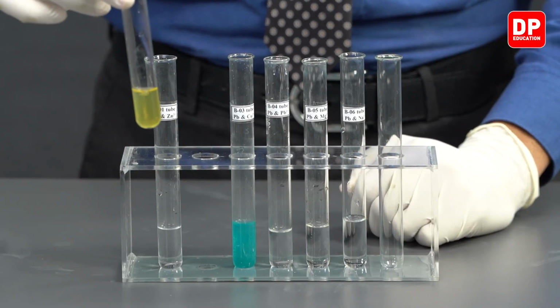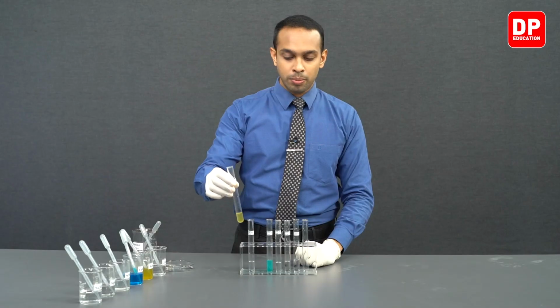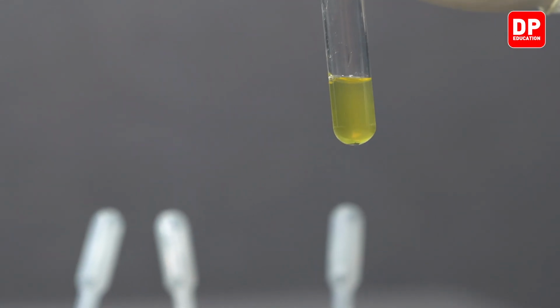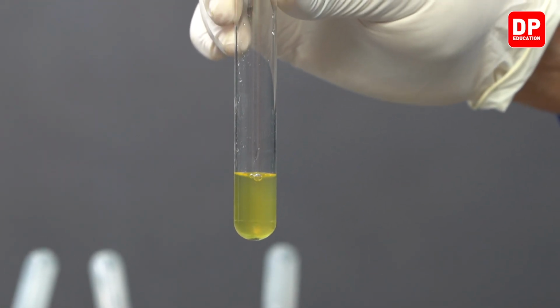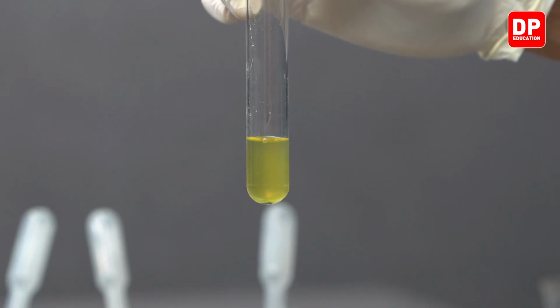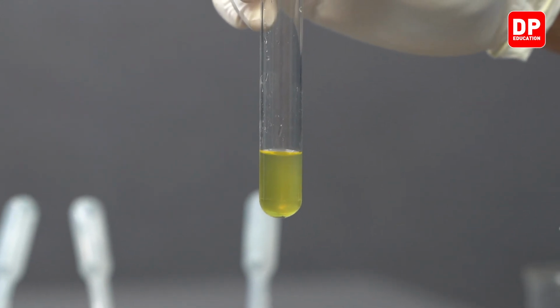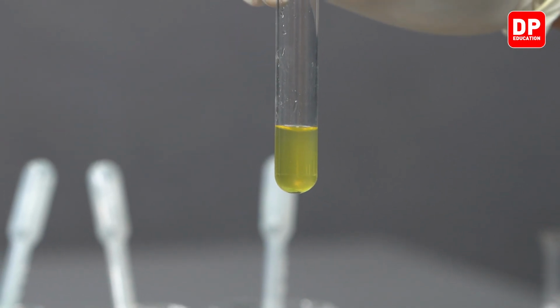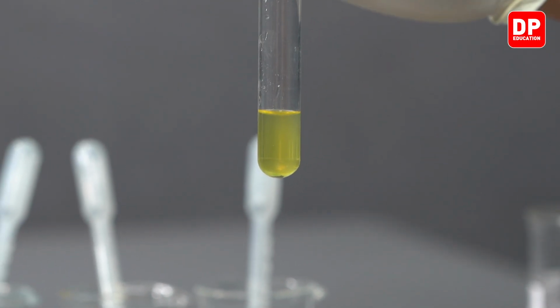We observe over here there is no precipitate formed, only the lead pieces at the bottom are present. You can barely see the lead piece. However, the lead piece is still there in the test tube, and there has not been any color change as well. Again, this indicates that the lead metal was not capable of displacing our Fe2 plus ions into iron metal.